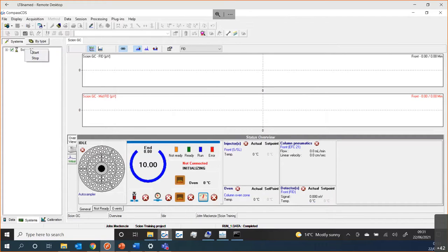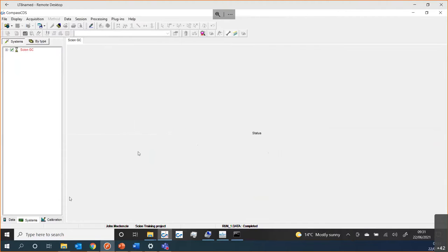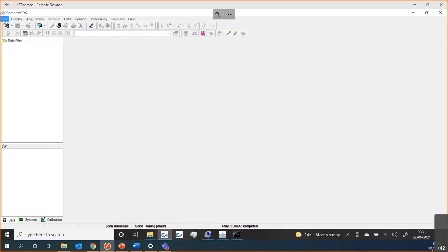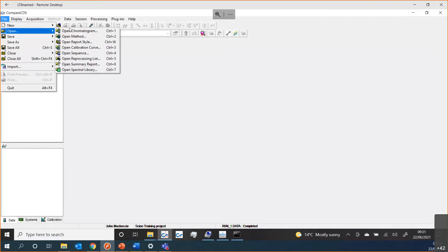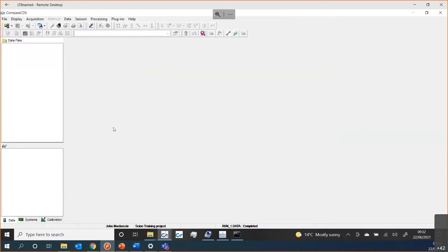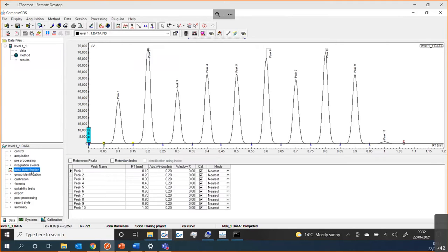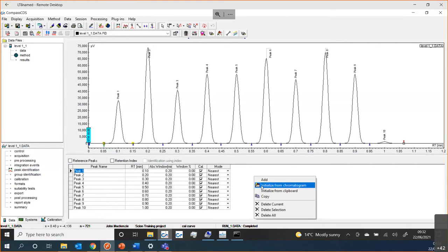The next aspect I wanted to look at, if this had completed, was to look at some data files and see what data we actually got. I created some data files in preparation for this. You can see I have them here with some nice peaks. They already have all the peak names. If I was going to do some work with these, I maybe wouldn't have any peaks identified. I could initialize from my chromatogram.